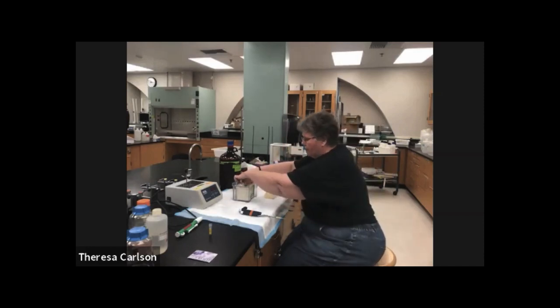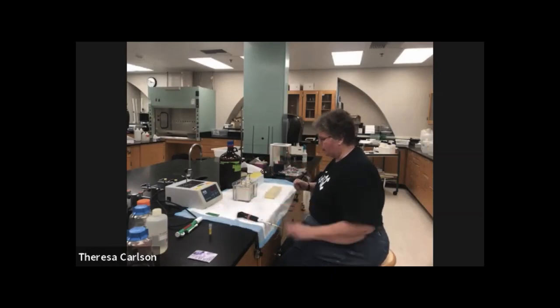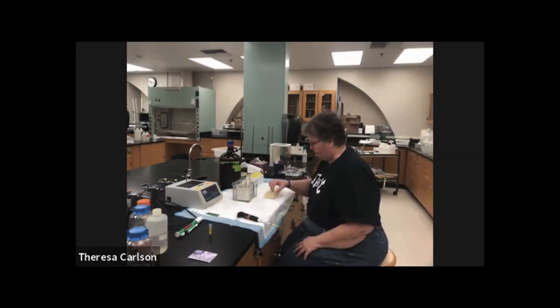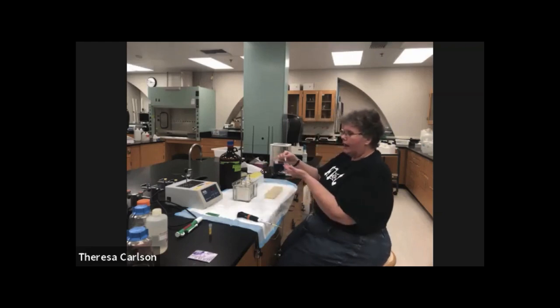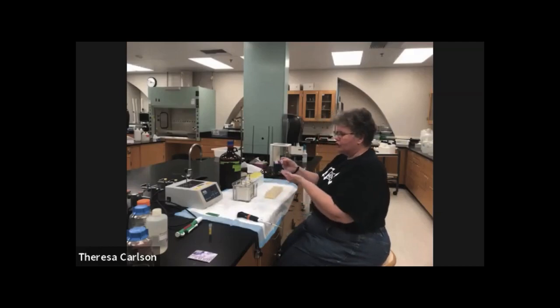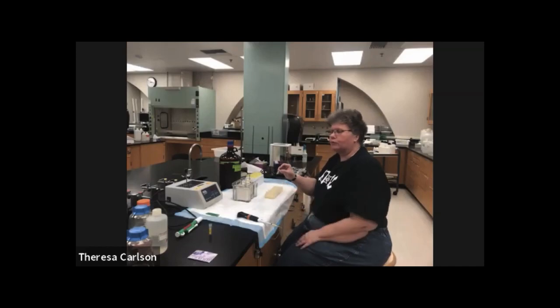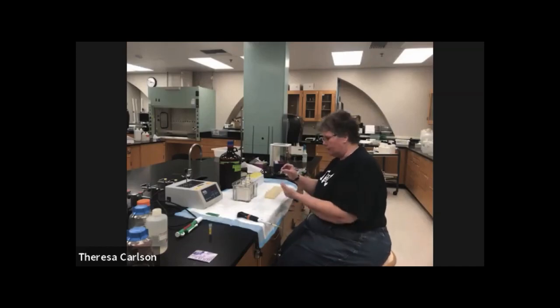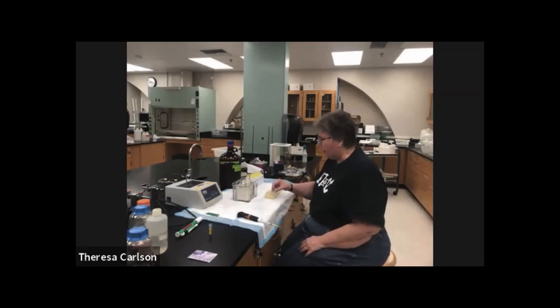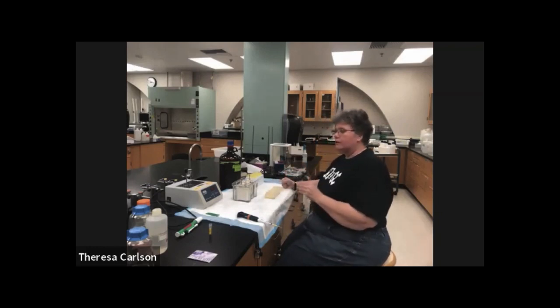So after we've done this, we're going to slowly and carefully pull up on our comb to take it out. And then we're going to be preparing our samples and heating them up. So we have our S1 and S2 and S3, S4. I've just taken approximately 20 microliters of each one, 20 microliters of the S1, 20 microliters of the S2, etc. And I've added an equal volume of our sample buffer.